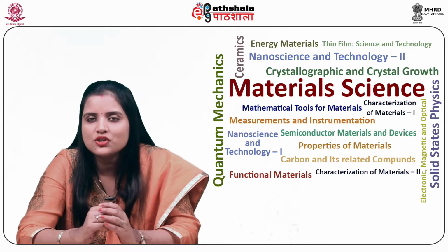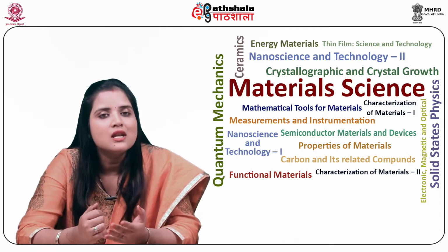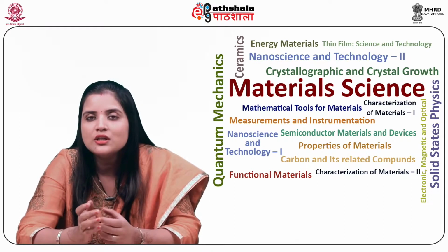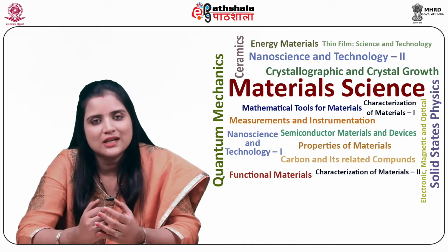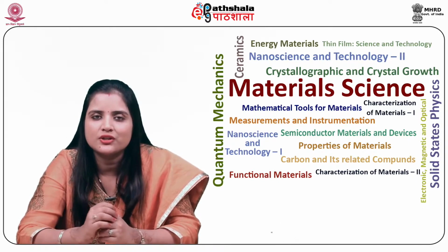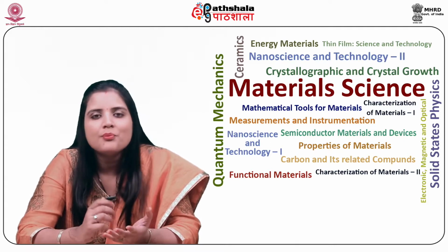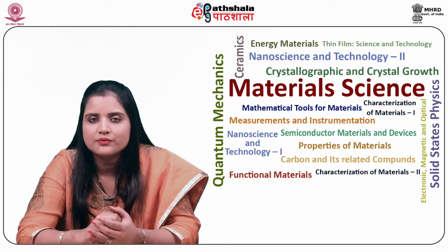Analyzing a sample with low incident accelerating voltage can cause some problems. First, the high excitation energy based characteristic X-rays cannot be detected. Secondly, quantitative analysis accuracy is degraded. Third, while performing the analysis on X-ray mapping, position shift in the incident electron probe occurs.